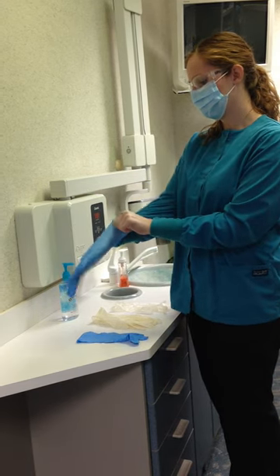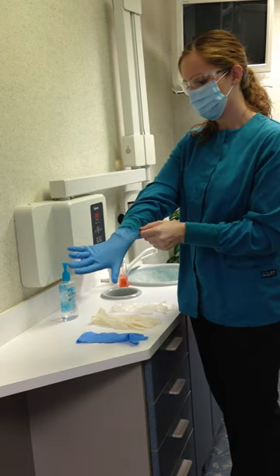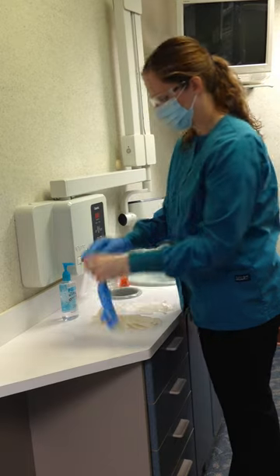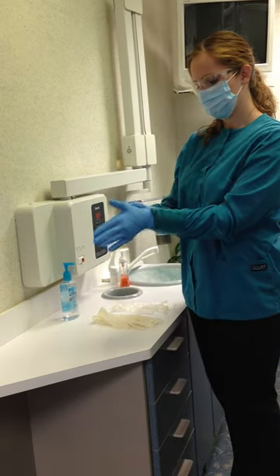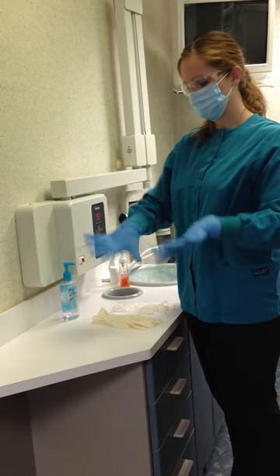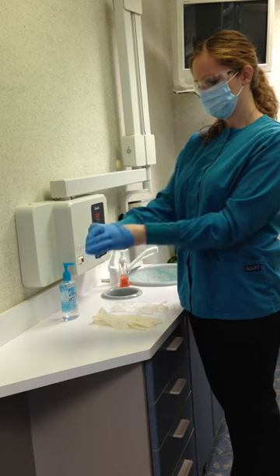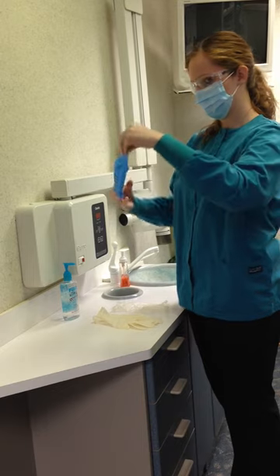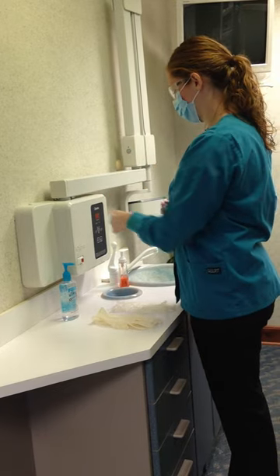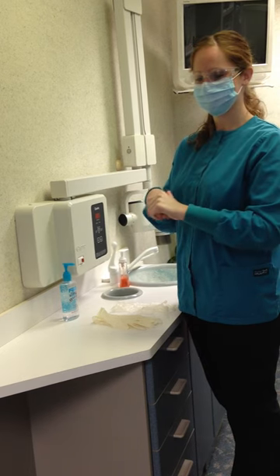When putting on examination gloves, pull the glove over the lab coat cuff, covering the skin on the hand and wrist. When removing the gloves, tuck one inside the other and then discard. Then thoroughly wash hands or sanitize. Gloves are an excellent way of providing a protective barrier for the dental assistant.